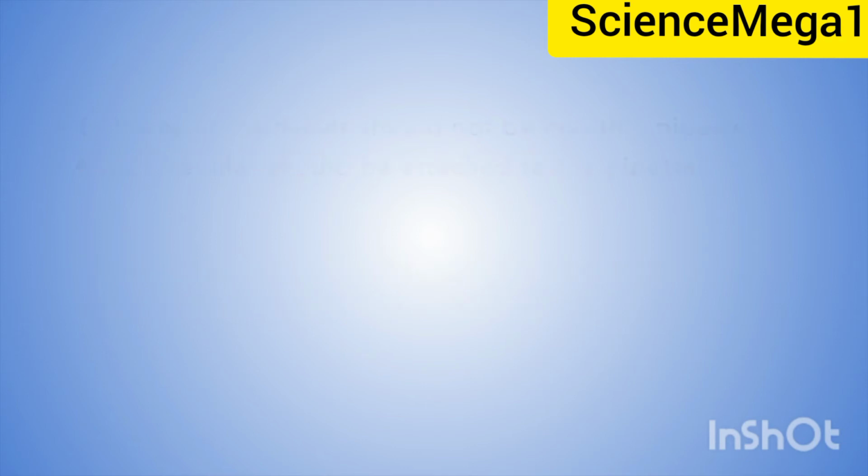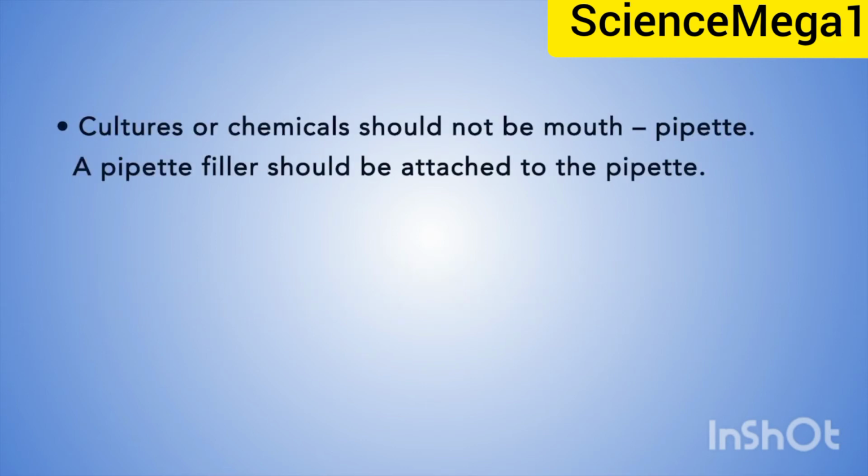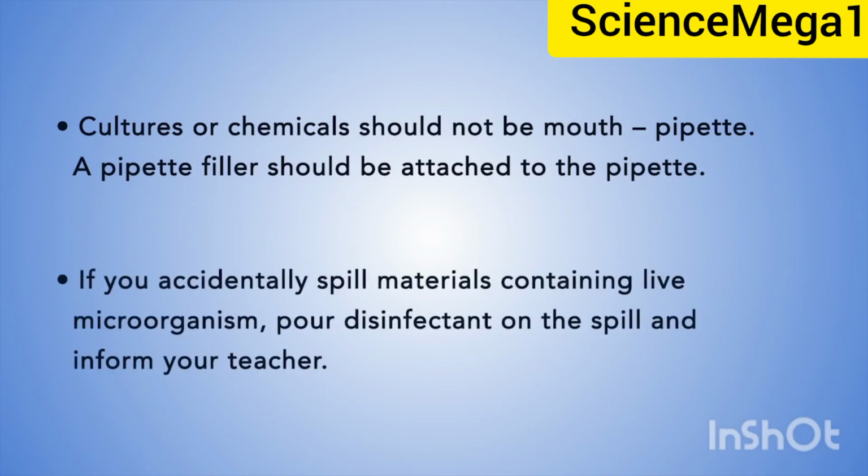9. Cultures or chemicals should not be mouth pipetted. A pipette filler should be attached to the pipette. 10. If you accidentally spill materials containing live microorganisms, pour disinfectant on the spill and inform your teacher.